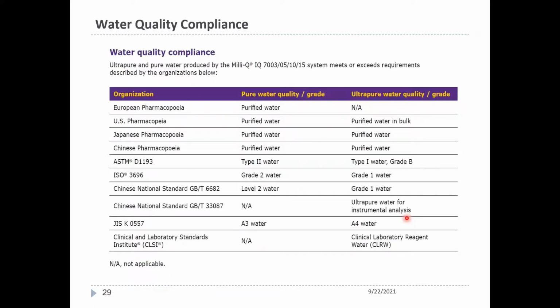Water quality compliance: various organizations, be it the European Pharmacopoeia, USP, the Japanese Pharmacopoeia, Chinese Pharmacopoeia, all give guidance as to the type of water you require in your lab. So purified water, and then especially for the biomedical lab, the Clinical and Laboratory Standards Institute, CLSI, would recommend the clinical laboratory reagent water.